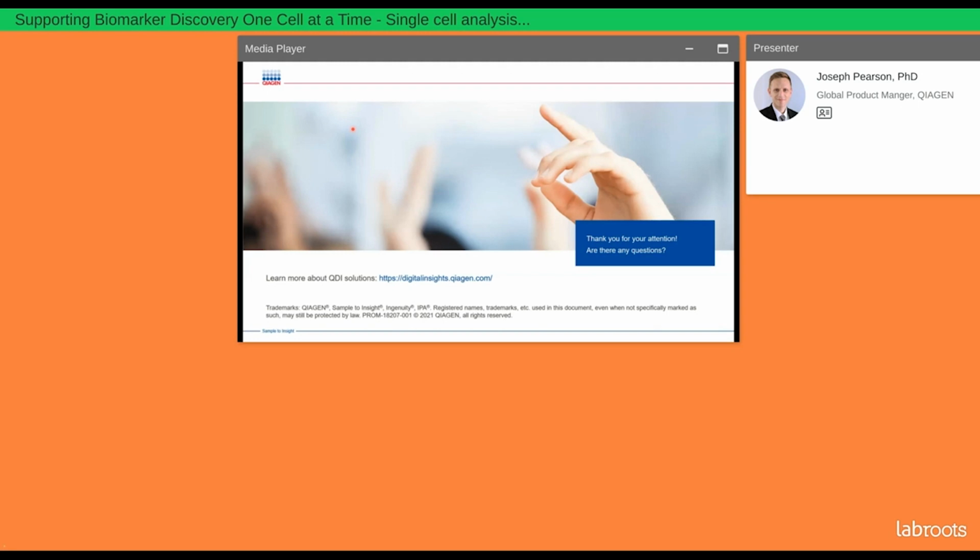And then you can click on any project you're interested, and with a click, download the full data sets, including the raw and the normalized expression values, the metadata, and the differential expression results into an OmicSoft project. And then you can then export individual data sets for your downstream analysis. Got it. Wow, that sounds really convenient.